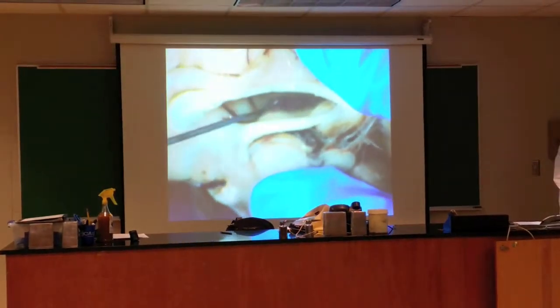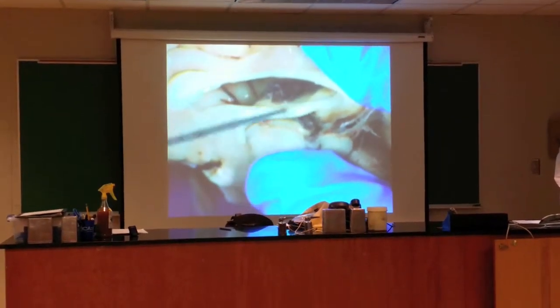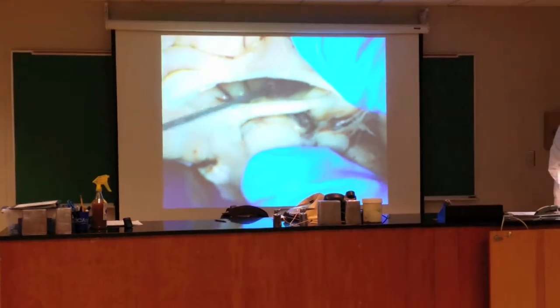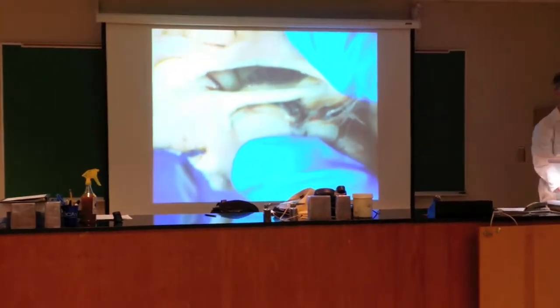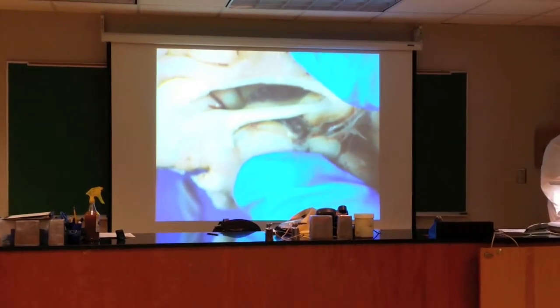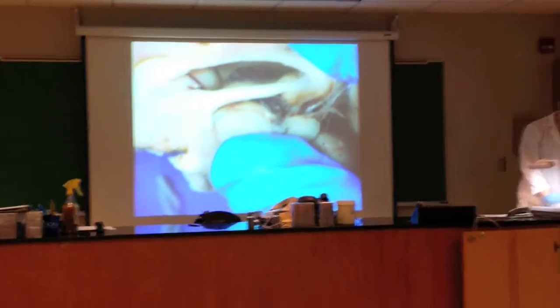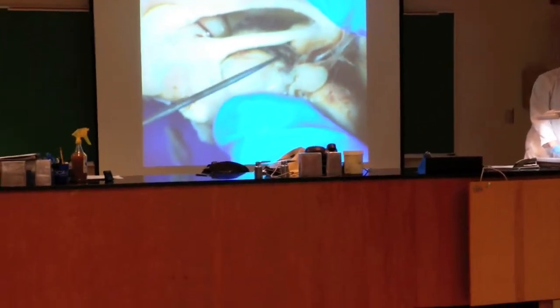So if I push open my ventricle, there's this brownish, gray, blackish stuff. This would be the choroid plexus. This would be the special set of cells that produce the cerebrospinal fluid. You'll find that in both ventricles. You'll also find it in the 3rd ventricle underneath.